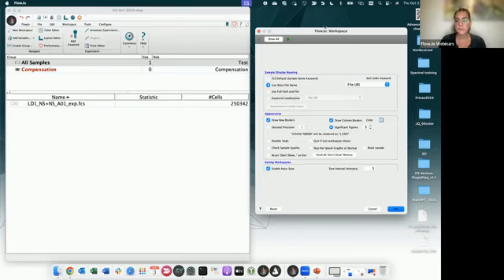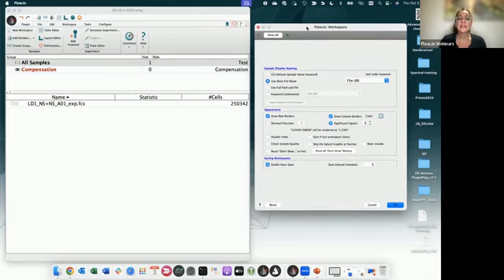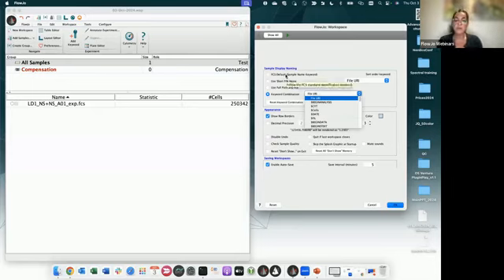In case you want to use a different way: you're not going to rename the actual file, but you can change the visualization of the file name within the workspace by using a keyword combination, for example. You can use different keywords. You first assign the keyword to the file, and then you can use that keyword to display on your workspace. But it's really not a case of completely renaming an original file within FlowJo. My advice in this case is always to use the short file name.